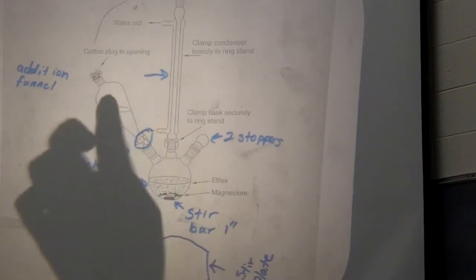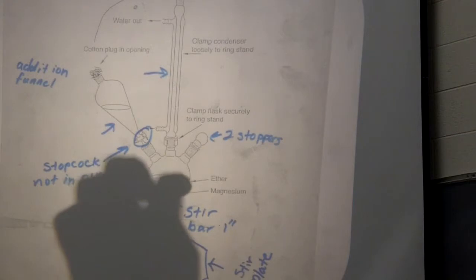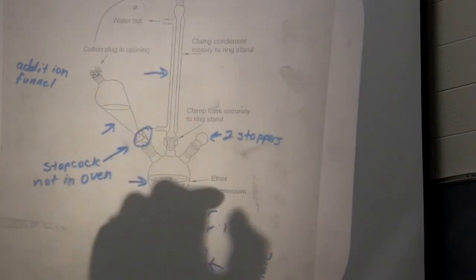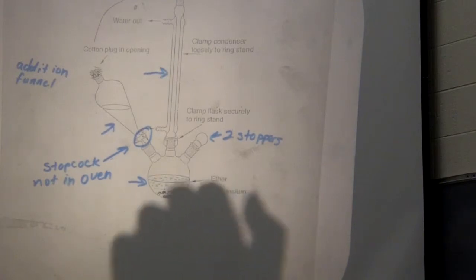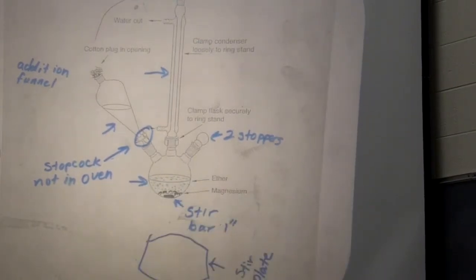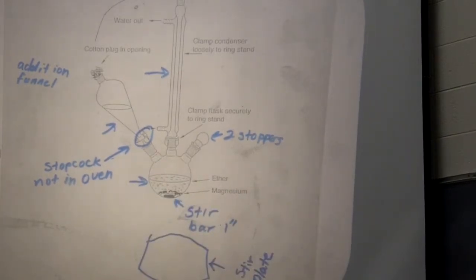So you're going to add this reaction mixture drop-wise, and you want to add about 5 milliliters, and then we're going to want to make sure that this reaction gets going. And so what you're going to see is on the actual pieces of magnesium, you're going to see bubbling, and you're going to start to see discoloration in your reaction. You're going to start seeing the dispersing of the iodine color and cloudiness. That is your cue that your reaction has started.